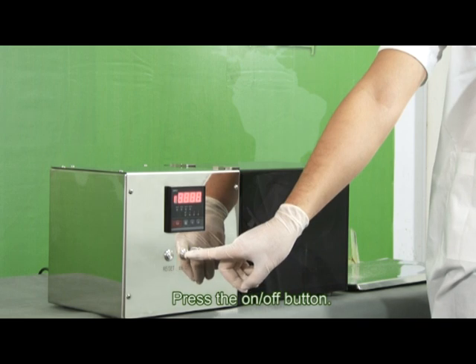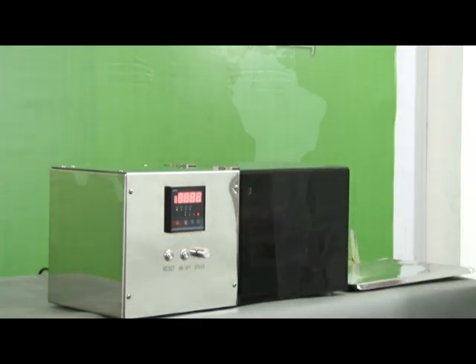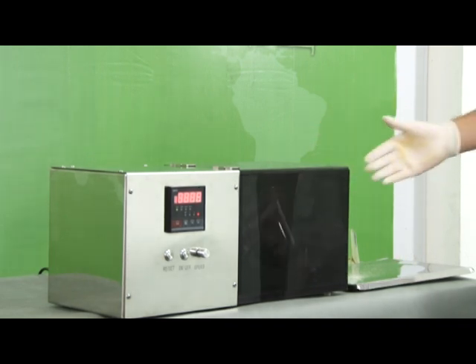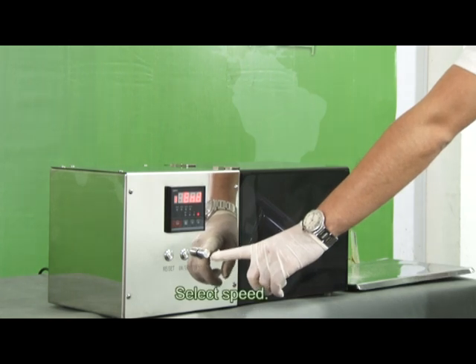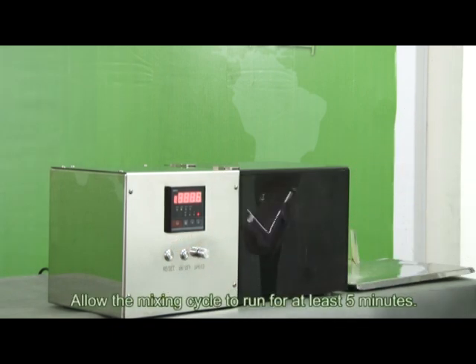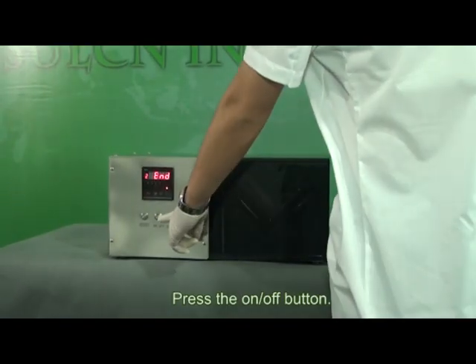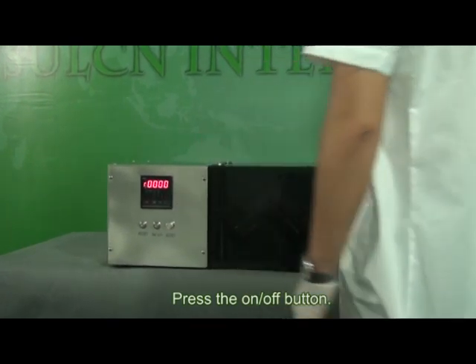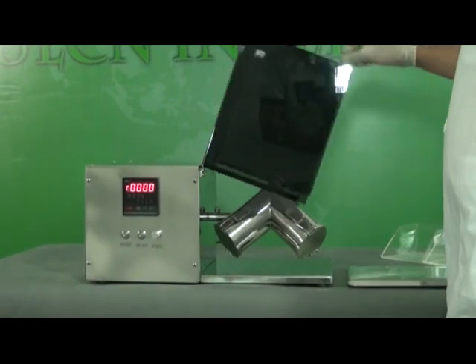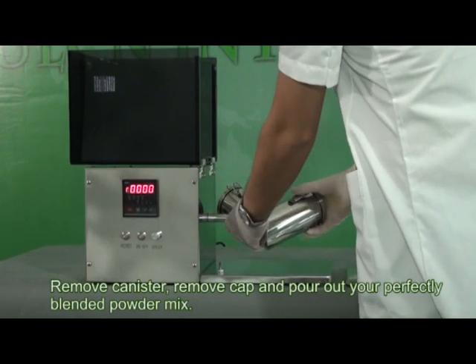Press the on/off button to start the mixer.